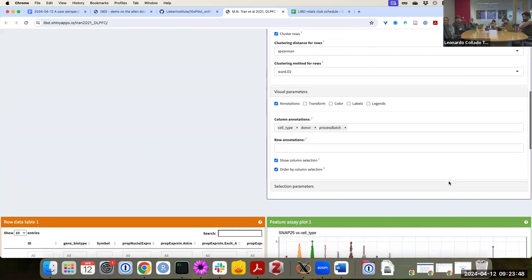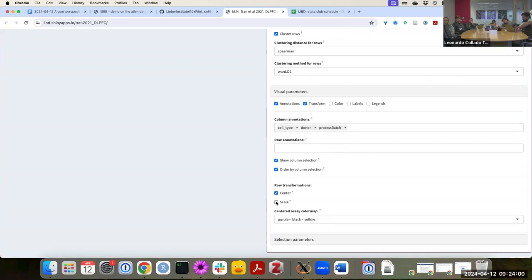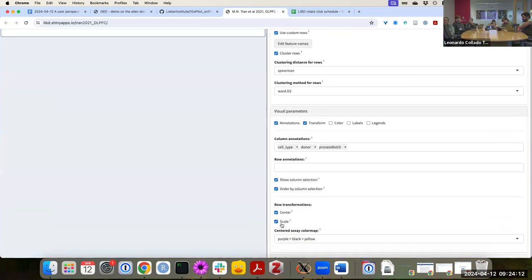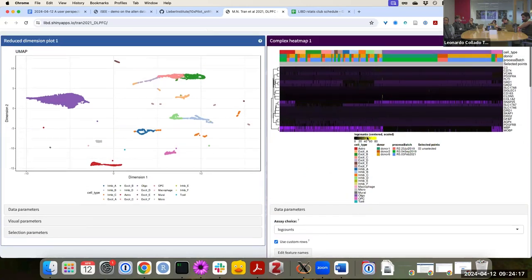We have a short video, a 5-minute video, on what is called centering and scaling. And so we showcase why you probably do want to center and scale. And that's because that can help you. This one seems to be a little bit broken, the color over here. But centering and scaling is useful if you want to visualize differences across genes that have different means of expression.